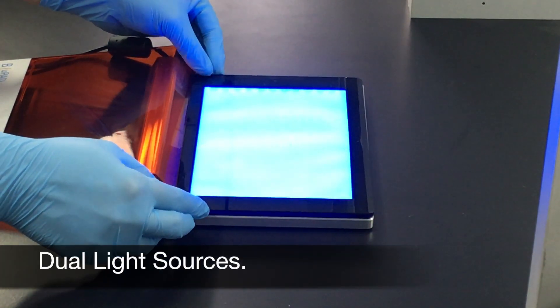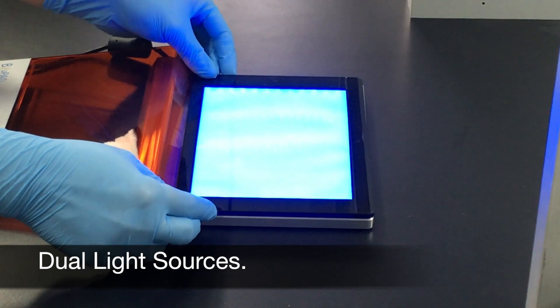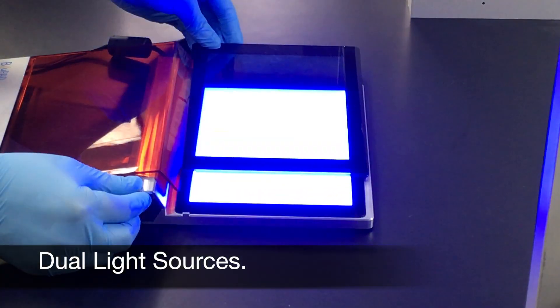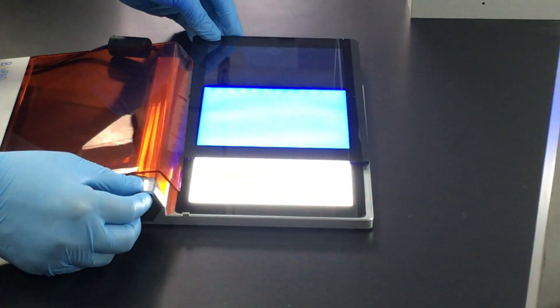It mainly has two LED light sources available: the LED blue light for the agarose gel and the LED white light for the protein gels.